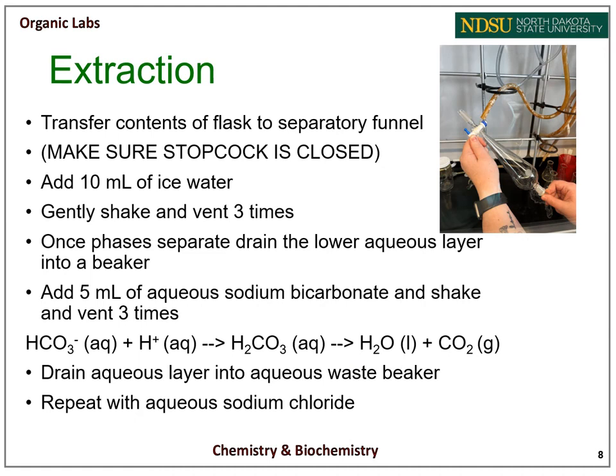You will shake and vent the separatory funnel 3 times. Place in the ring stand and allow the layers to separate. Drain the aqueous layer into an aqueous beaker.